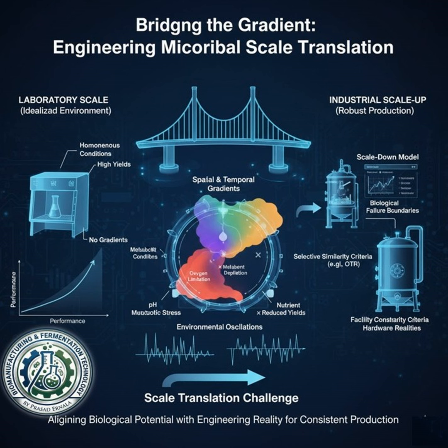Okay, what about mixing limited substrate gradients? The high glucose pockets. There you see a really nonlinear link between your feed rate and your oxygen uptake rate, or your CO2 evolution. The metabolism isn't smooth and predictable, it's spiky. And the batch becomes incredibly sensitive to tiny changes in where you put your feed pipe. And finally, that instrumentation artifact, the slow DO probe. The diagnostic is to test it. If the probe response gets really sluggish, and especially if the reading itself changes when you just change the stirrer speed, you've got false security from that surface film.